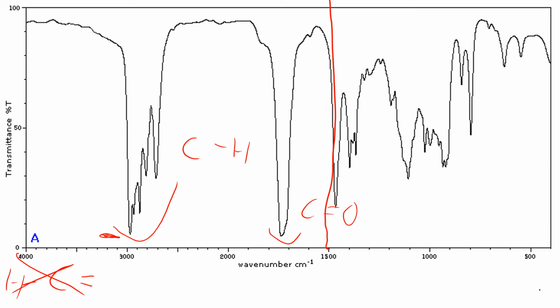So the way we approach these infrared spectroscopy graphs is we look for peaks, identify and describe the peaks. So I would call this a strong, broad peak between 3,000 and 2,850, and that peak is going to be indicative of the presence of C to H bonds. Then I move over here. Any other peaks that are present, I also describe those. You'll need to refer to them by their shape and size and intensity. That means a broad or narrow peak is the shape. The size is basically how broad it is as well. And intensity is how far down the graph it goes, like how close to the bottom of the graph it gets. That's it.